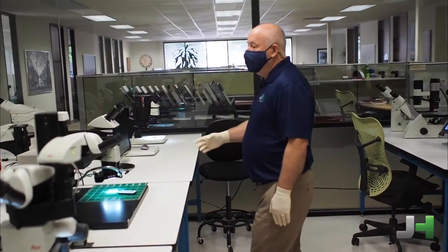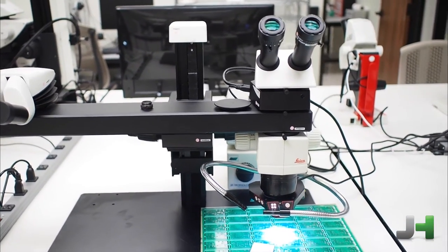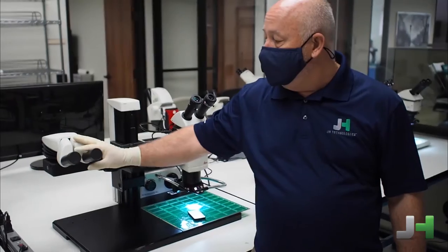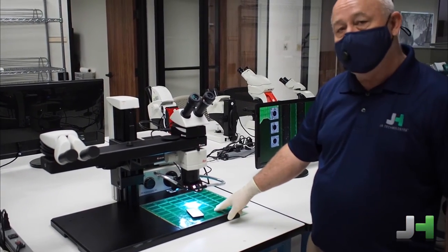Moving along, we have teaching microscopes as well. Again, this is part of the M series products. And again, it does have ergonomic functions, but also this allows two people to look at a sample at the same time.